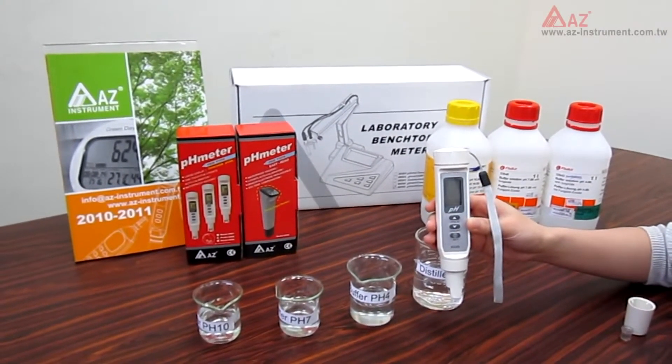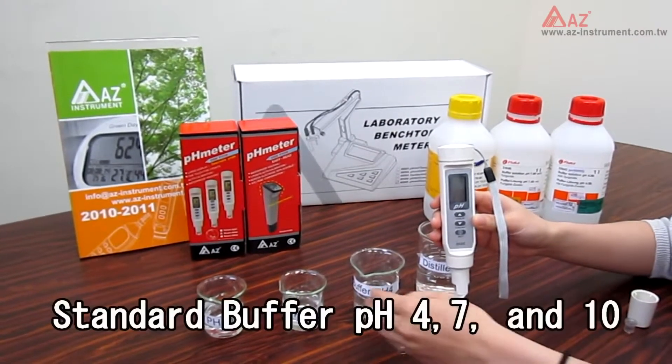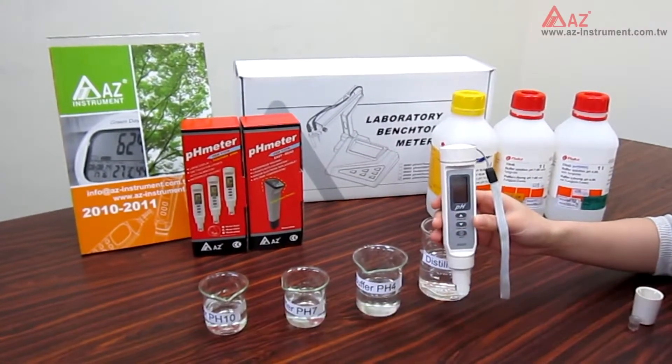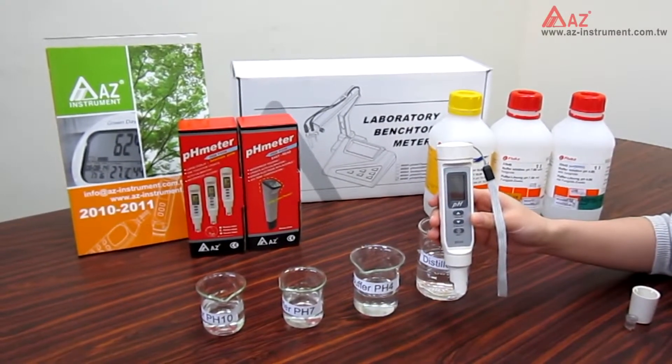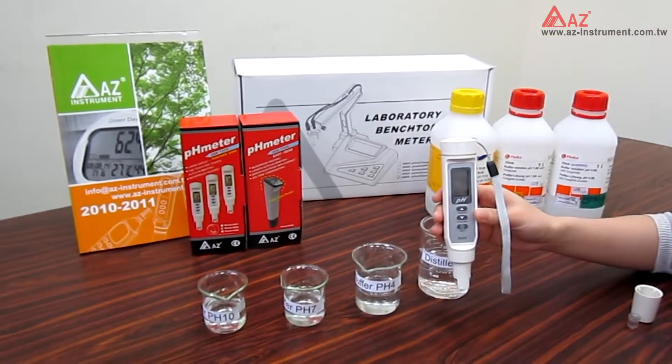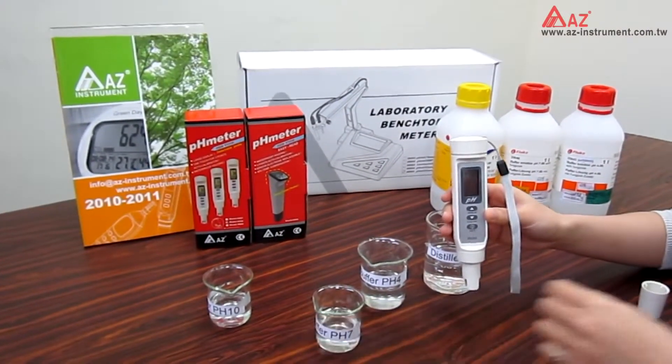To prepare for the calibration, you need to have the standard buffer at pH 4, 7, and 10, and also distilled water for rinsing the electrode during calibration. It is suggested to start with pH 7 calibration first, then pH 4 and 10.